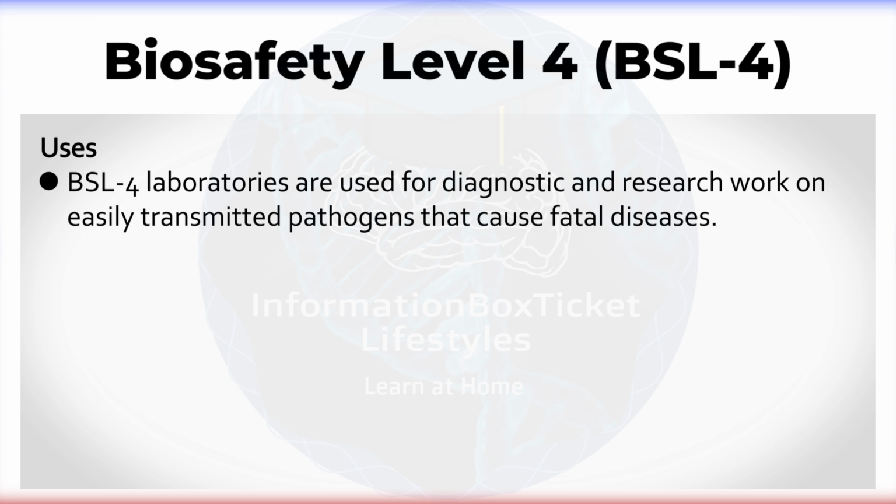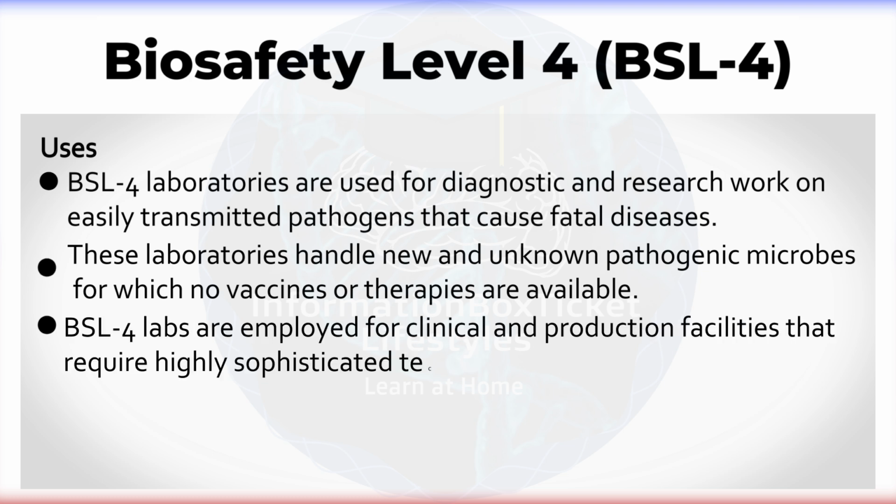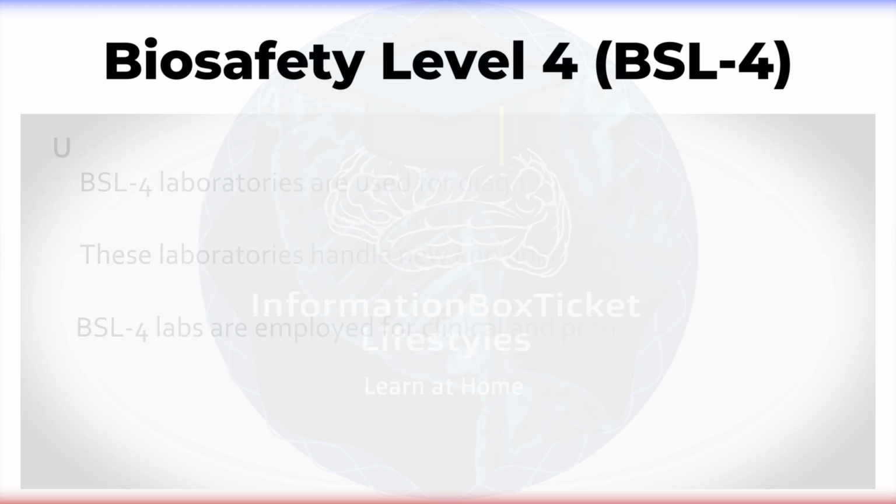BSL-4 laboratories are used for diagnostic and research work on easily transmitted pathogens that cause fatal diseases. These laboratories handle new and unknown pathogenic microbes, for which no vaccines or therapies are available. BSL-4 labs are employed for clinical and production facilities that require highly sophisticated techniques and advanced processes.